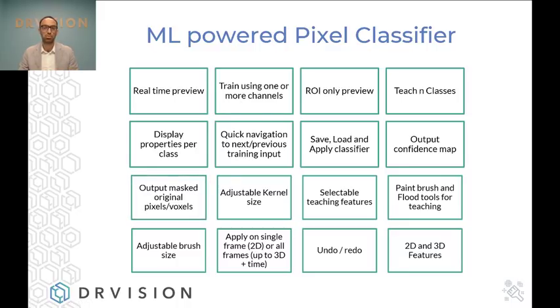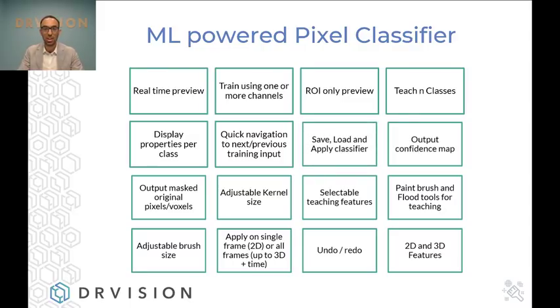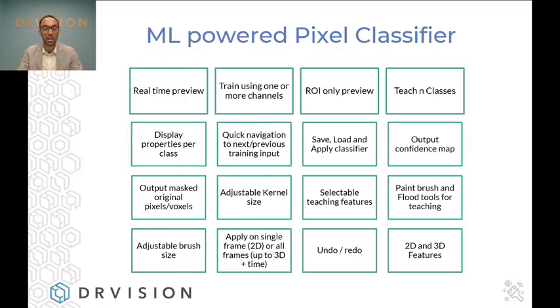Let's say in a histopathology section, you may have bands of tissue that are of a particular type. You then use a large kernel, and that's much easier and runs very nicely and creates nice channels that separate those bands. Whereas if you're looking for really tiny objects like nuclei or filaments, then you can use the small kernel, and that will work better.